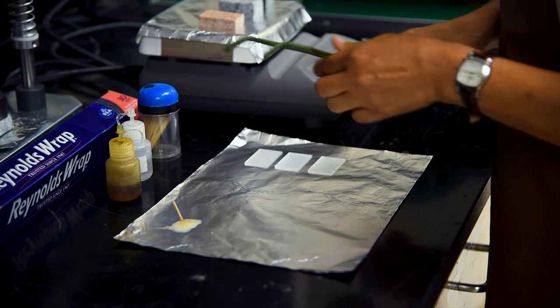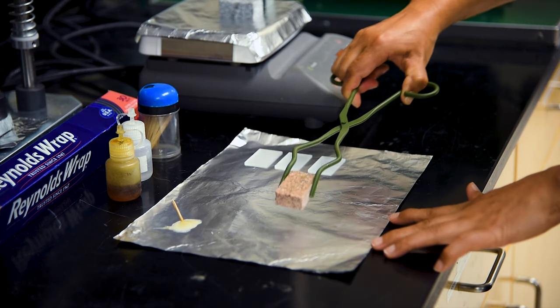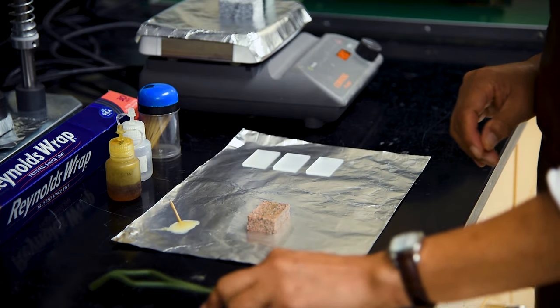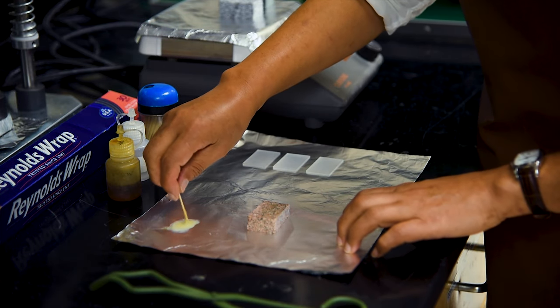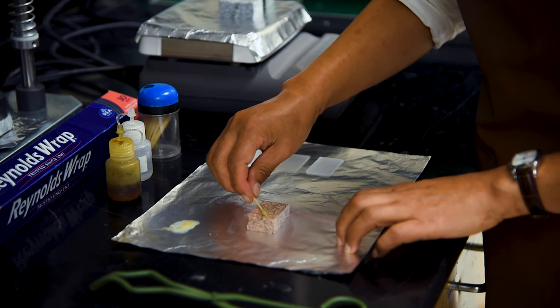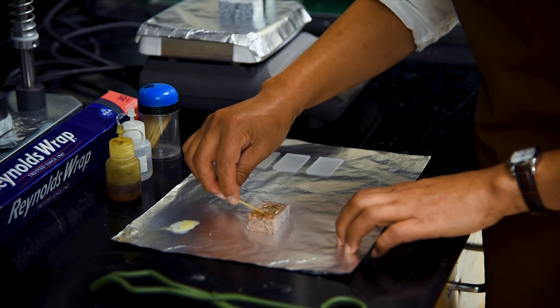Using the tongs, the sample chips, which have been heating up on the hot plate, may now be retrieved and placed polished side up on the sheet of foil. Using the toothpick, epoxy may now be applied to the polished surface of the hot sample chip. The heat will reduce the viscosity of the epoxy and allow it to flow more easily across the surface and to seep into any pores or microfractures in the sample.